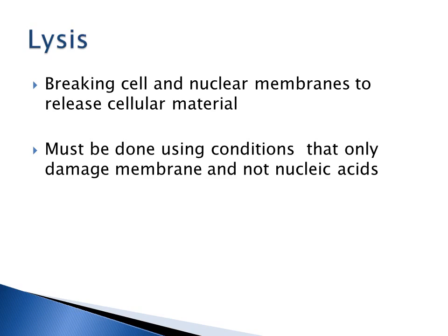So the first step in extraction is to lyse or break open the cellular material. And this is done using conditions that only damage the membrane of the cell, but not the nucleic acids, because you need to use those nucleic acids for various other purposes.